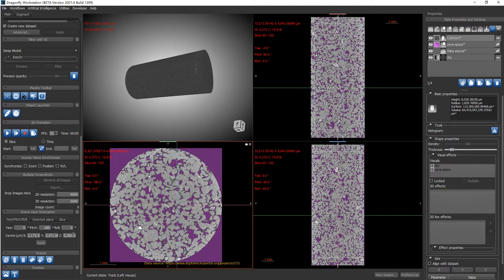This shape tool can have a few actions. The region of this shape can be either removed from an ROI or an image. So we see structured grid. The structured grid may be an ROI or an image dataset.